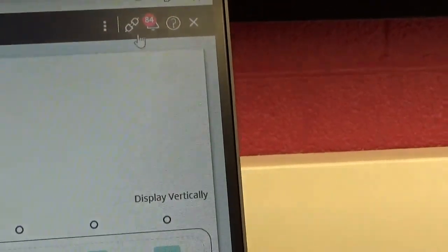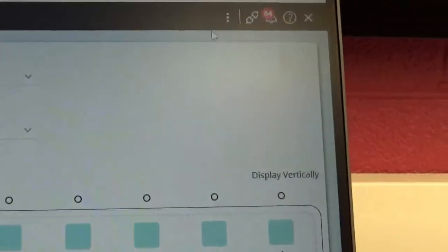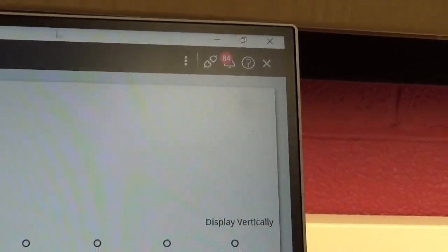I'm also going to set my temperature to be 25 degrees C, but first I actually have to go over here, and well, actually I have to turn the instrument on. There's an on-off switch. Turn that on or this won't work. So I see that this little icon up here, this thing here, is separated. So if I do this, this is what I have to do, is click on this thing here. And it doesn't work.